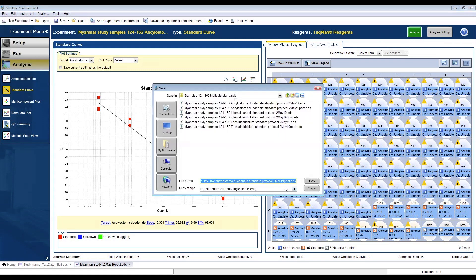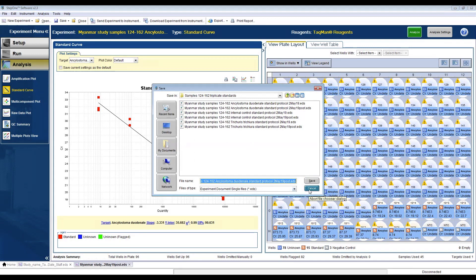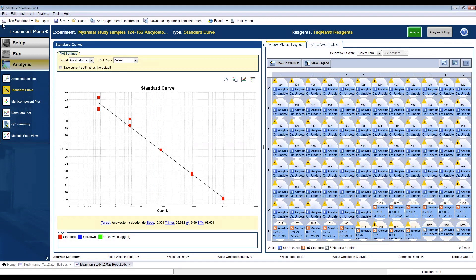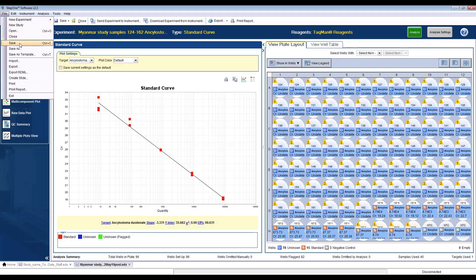After every run, save again your file and export the results in an XLS format in your folder. Thank you.